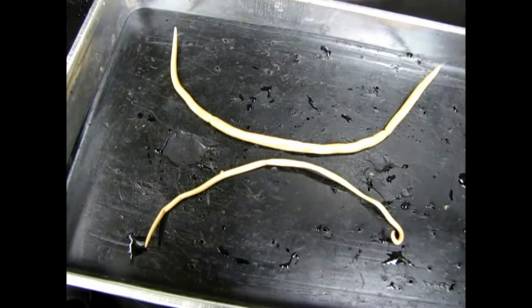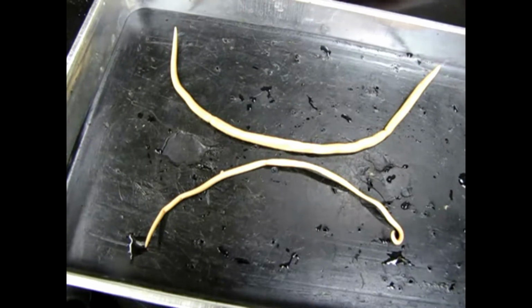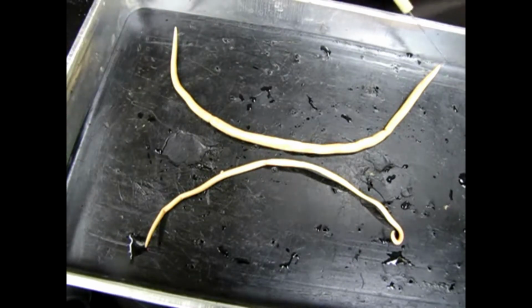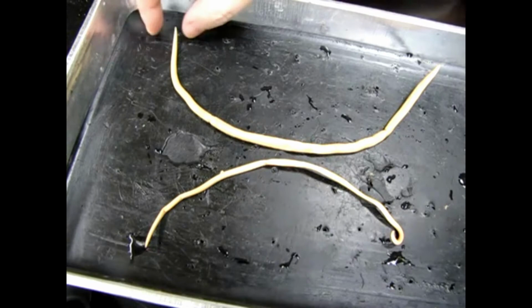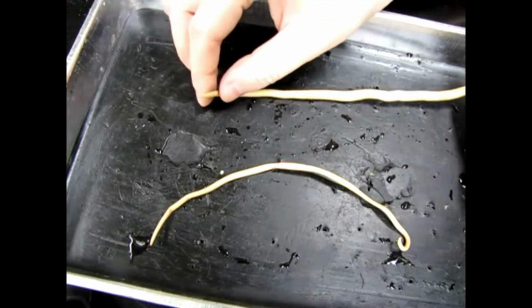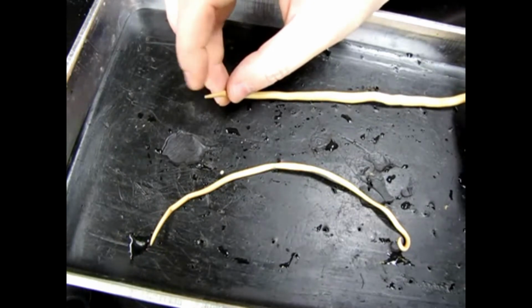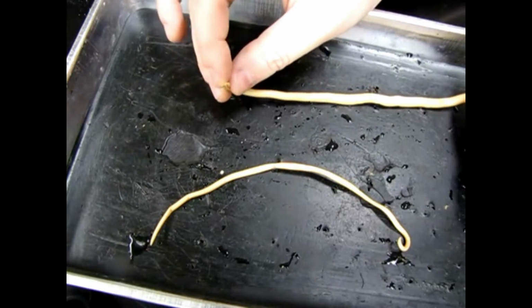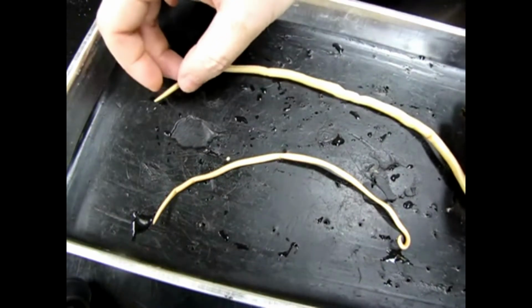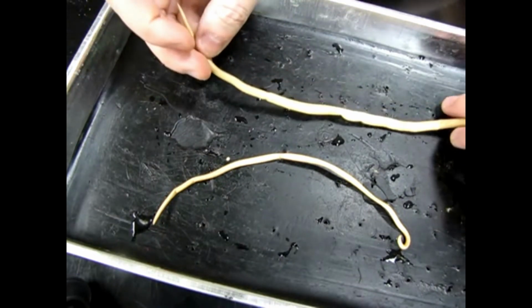So speaking of that, there is one other externally visible characteristic on the female. It's difficult to find, but I'll show you about where it is just in case you can locate it. So we've seen on the male, this is the posterior end, this is the anterior end. So same on the female, posterior, anterior. If we look closely at the female's anterior, the tip of her anterior end, there is actually right here, there's a number of very small lobes, and those are surrounding the mouth. So if you see those, you know you're at the anterior end.